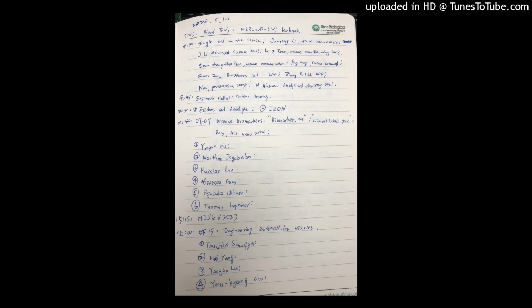I'd like to share that I face quite some challenges when studying mouse blood. The reason is we're working with different animal specialists, and they have different ways of extracting blood from mouse, especially when we need to study more than 400 microliters of blood, so usually we use cardiac puncture. But when we try to communicate across different labs, how to do cardiac puncture without video is extremely challenging.